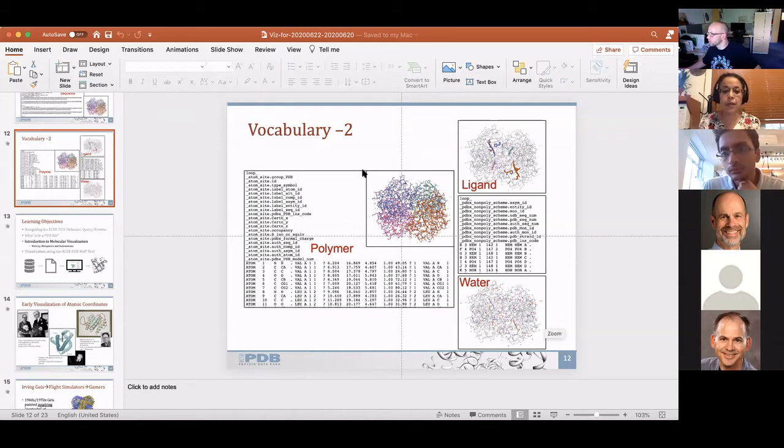So you're right. Mike Picard asked, what are the aniso lines? Those are the anisotropic coordinates. If the file has anisotropic data, those additional details will intersperse between the regular coordinates, and that makes it a little awkward and not easy to read visually. But given to a computer, it knows exactly where to pick up information from to do visualization or calculation analysis, whatever is necessary. Okay. Any other questions before we get into a little bit of history?